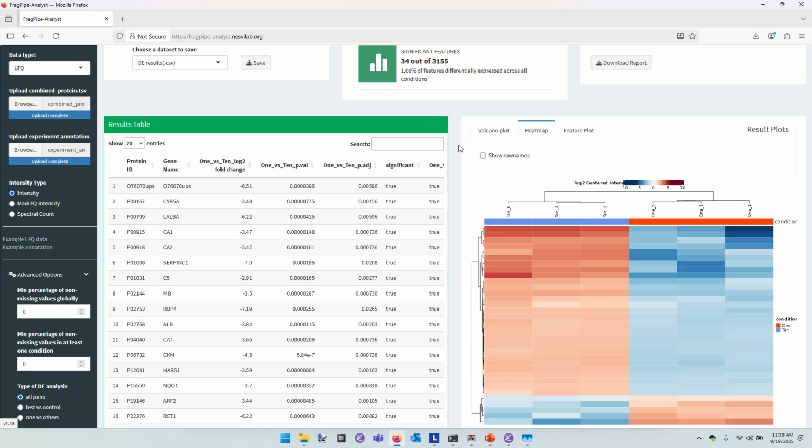If you know that one cohort is systematically more intense than the other, then something of the sort is going to be needed. We ran into that a lot with affinity proteomics doing pull downs, because negative controls have nothing like as much protein in them as do the positive experiments. PCA would also show if there is an outlier, right? It can be, yes.